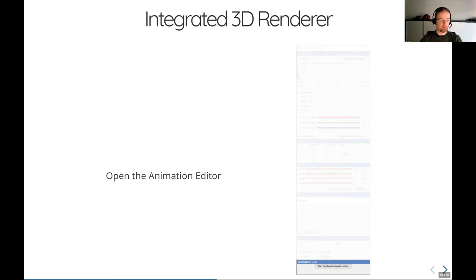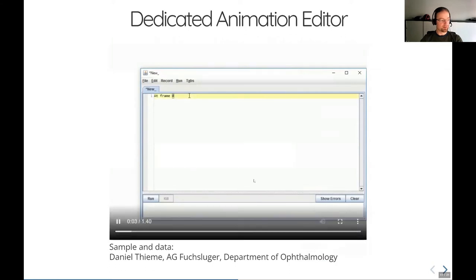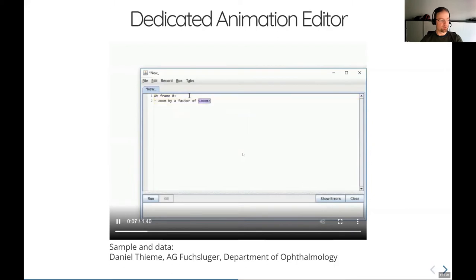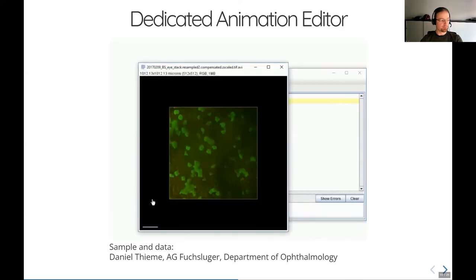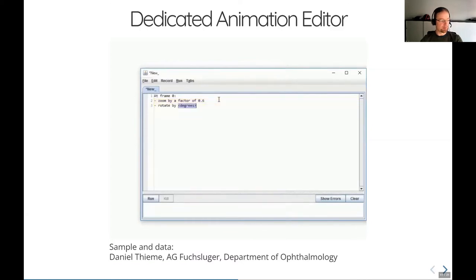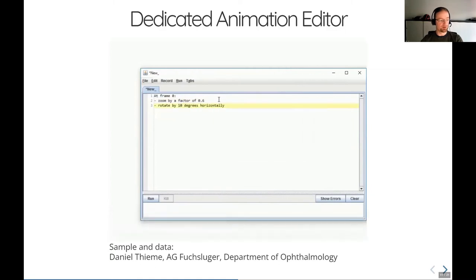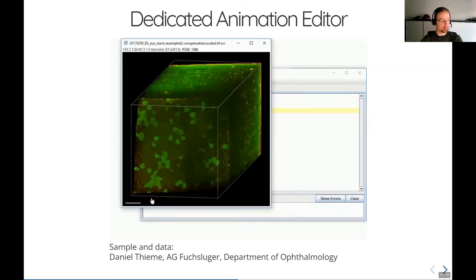And the good thing is really all of these features can be animated using the animation script. For that, we typically use this animation editor. And here is what it looks like. So let me just show you what this looks in real life. So here you can watch me. You see the first instruction, I will just say at frame zero rotate zoom by a factor of 0.6. Then I click on run, and I will get the resulting animation, which is in this case just a still image. You can see while I am typing that the animation editor is fully autocompletion enabled. So the user does not need to memorize anything, but you can easily find out just by letting you guide through the autocompletion menus.